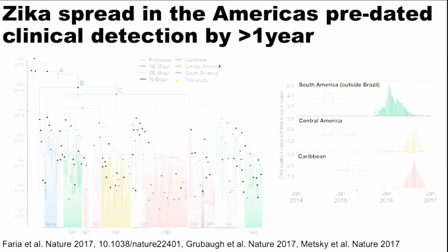And the point about this slide in Zika is just simply to show that after we'd collected a whole bunch of Zika samples and sequenced them, we were able to reconstruct a phylogenetic tree. And in so doing, we were able to show that at the point that Zika was detected and that association with microcephaly was made, sometime around April 2015, the first clinical case, when we actually draw the phylogenetic reconstruction, we see a vast amount of genetic diversity and Zika affecting, we infer, a large number of different regions of South America within that timescale.